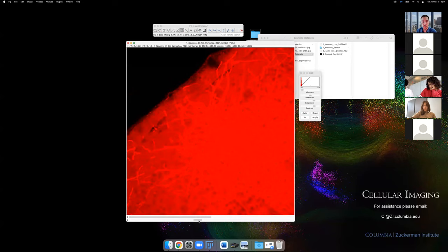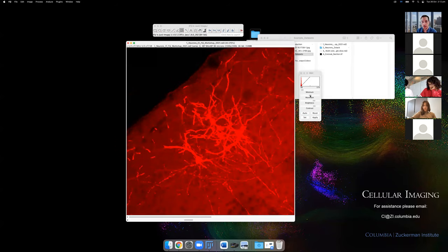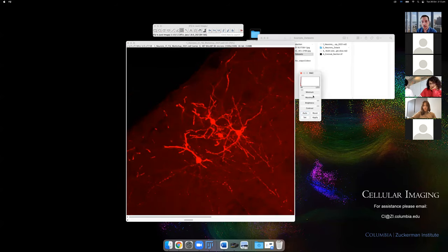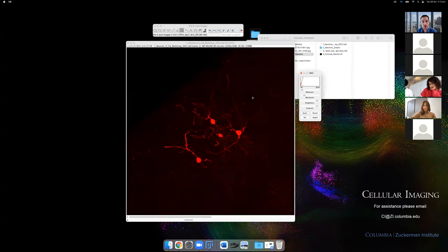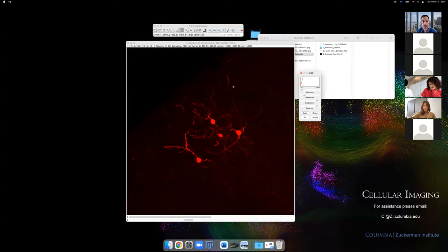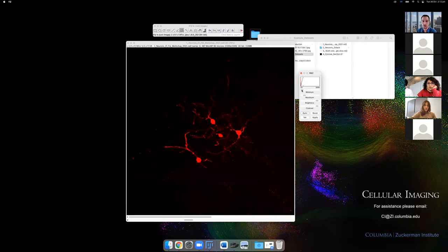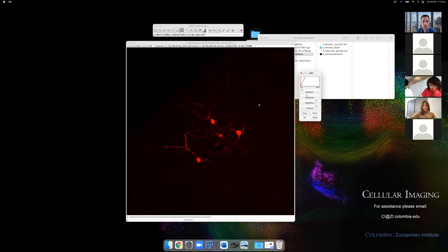A really nice thing about Fiji is that when you hover the cursor over the image, the status bar shows you the intensity value at that position. You can very quickly get your bearings and figure out what to adjust the levels to. For example, a cell might be around 10,000–12,000 and the tissue background might be around 300.